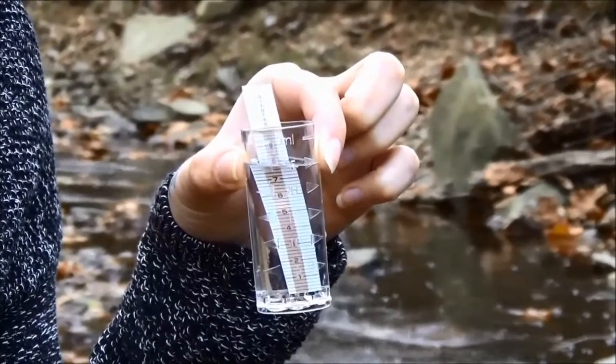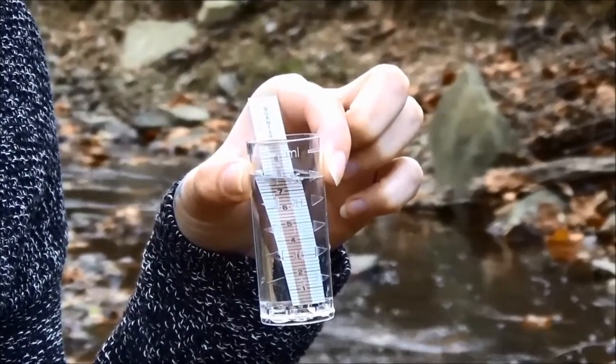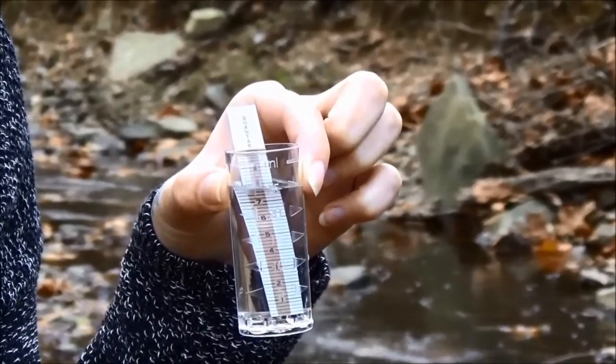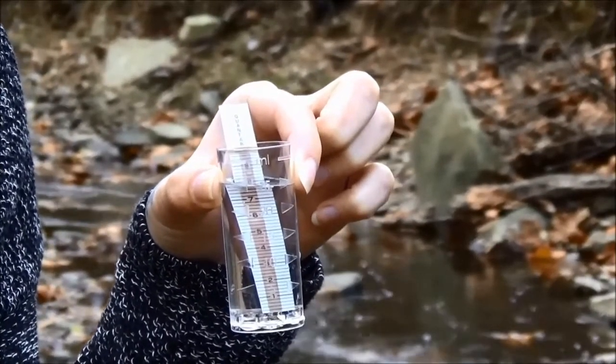Chloride is a measurement of salts in the water. This is an especially helpful test to do in the wintertime as road salt is being applied, to see what kind of impacts that might have on your stream. Salts are extremely toxic to aquatic life.